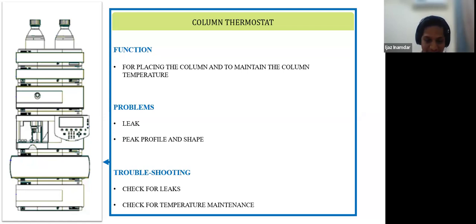It goes into the bin, because mass spec, we know, is a destructive technique. While detecting the molecule, it will destroy the molecule. So we cannot take the eluate out of the mass spec. UV is not a destructive technique. What it does is record the measurement. It records the UV absorbance. That's it. So it is not destructive.